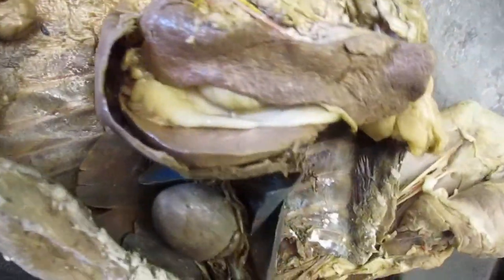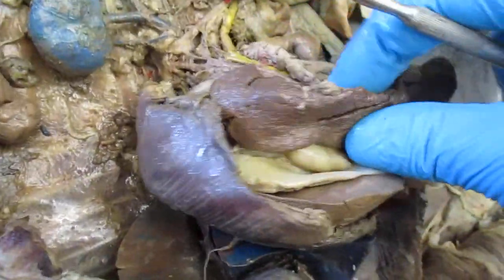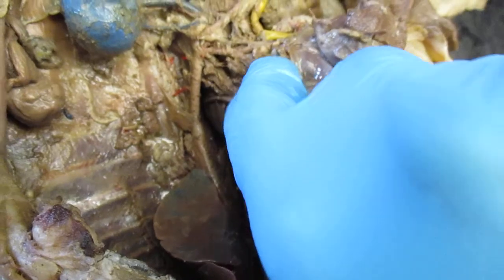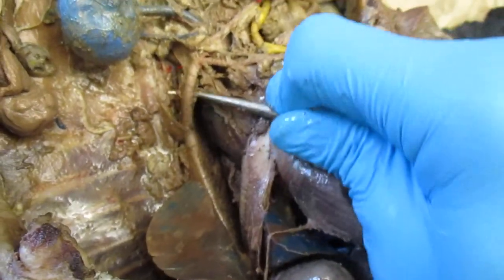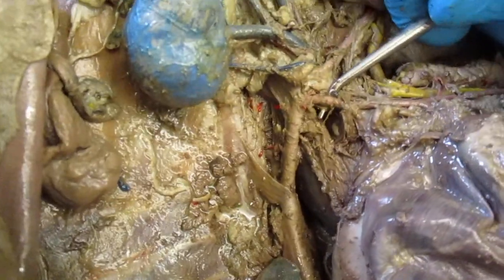And then you have the, let me find a better one here. Well, still not perfect, but you can pretty much see what I've just mentioned. Your diaphragm again, your spleen, and then you can see the descending or thoracic aorta. You see this first branch here. Let's go to another cat.